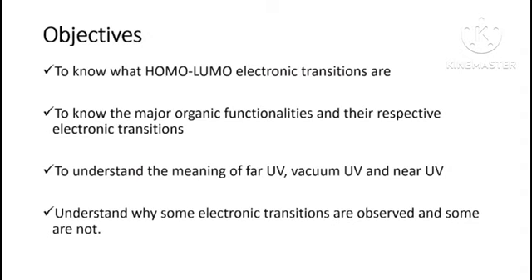And also we'll look at the explanation or the meaning of far UV, vacuum UV, and near UV. When you hear these terms, what do they convey to you? When someone tells you that this particular wavelength or radiation is in the far UV column, what does it mean? That is what we are going to look at as well.